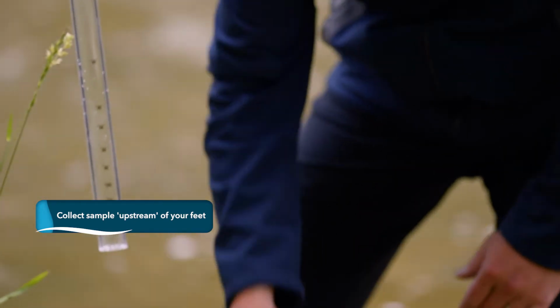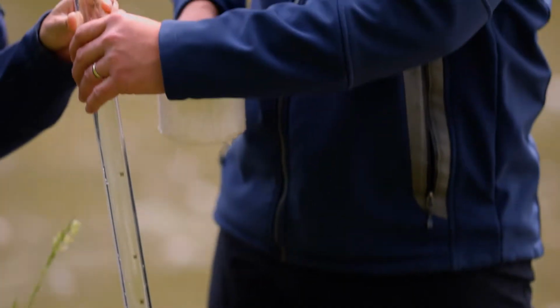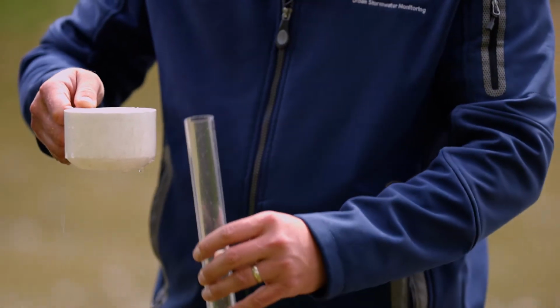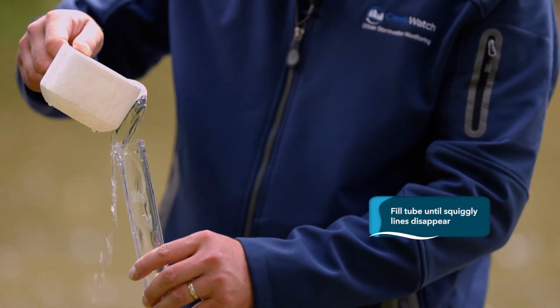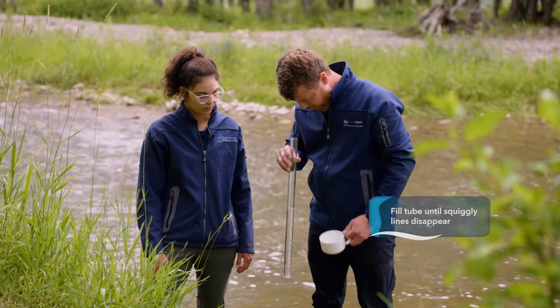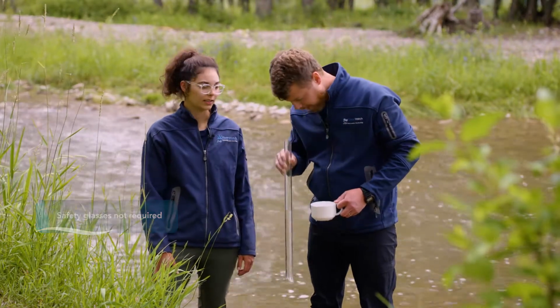So I'll get you to hold that for a second. There. I'm going to grab some water. All right, excellent. And now we're going to fill it up until the lines disappear. All right, let's take a look. Oh, can you still see the lines? I can still see the lines. I can still see the lines too.